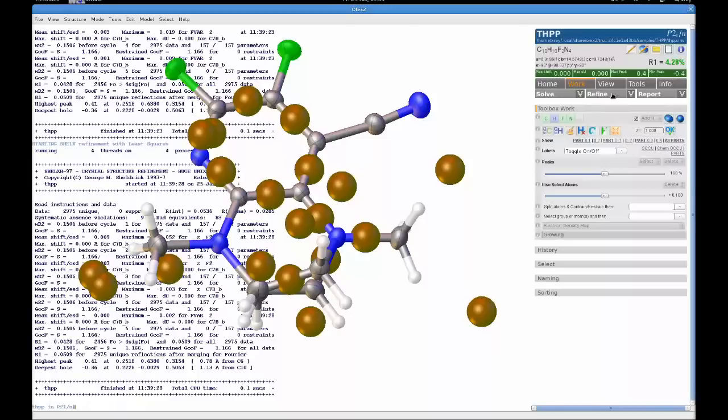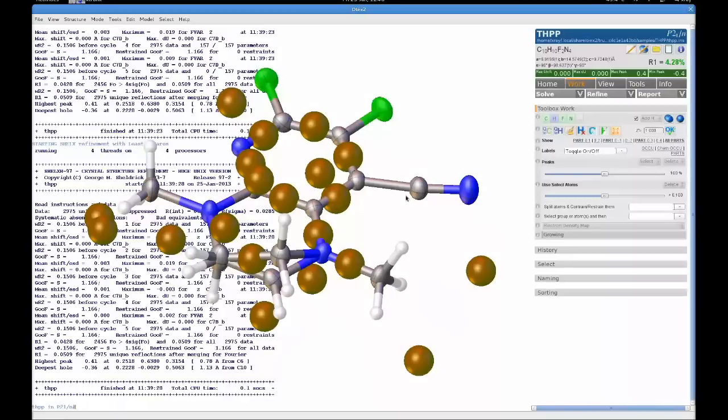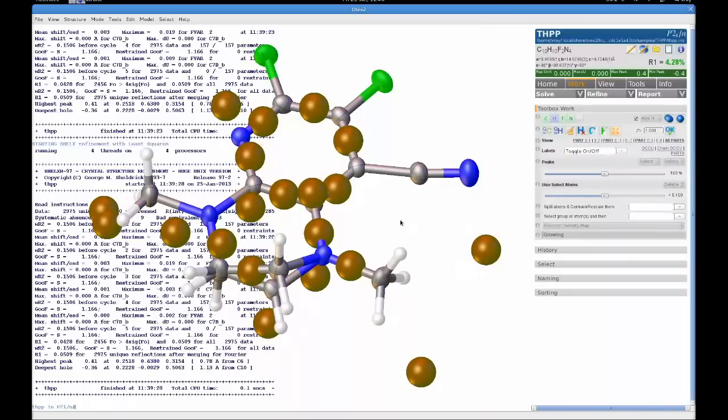It's basically rather than saying, well, there's only one way to do something and that's always to use a GUI, what they're doing is saying, well, we know that one shoe doesn't fit all, therefore we're going to give you a range of ways to do what you want to do, and you use the one that you're comfortable with, and that's it. So with the ways I'm going to show using this software, there's no this is the only way to do something. I'll be showing you different routes to get to the same sort of goal, and I'll try and show across all of those different techniques, based around the way I do it.